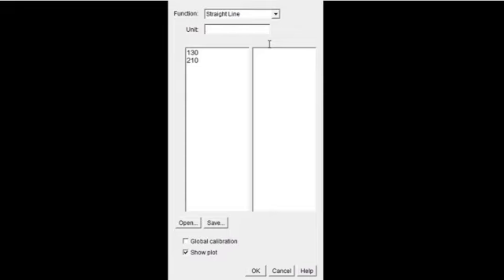And when we did the 70 samples for this study, there were remarkably similar values across the samples. So the average was 1.27 for dentine and 2.25 for enamel. And the standard deviation was under 0.03 across the samples. So as long as you use these particular areas, there really is very little variation. And then you click on global calibration, and then you click on OK. And now the scan is calibrated for mineral content.